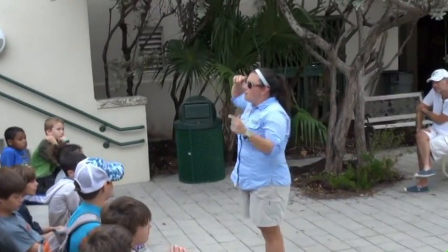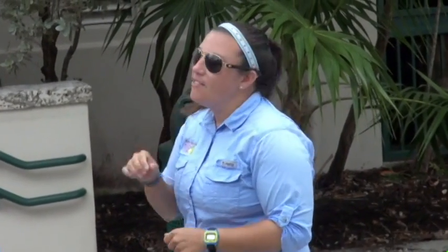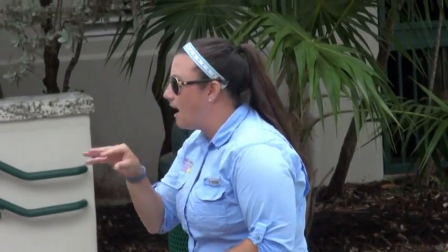The ampullae, like I said, they use it, basically they roll their eyes, put down their wonderful little eyelids, and then they use that sense to home in on what they want. Now, they can't use it when they're very far away, only maybe a foot in.